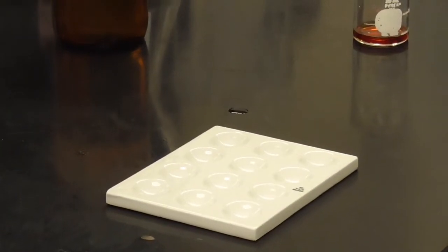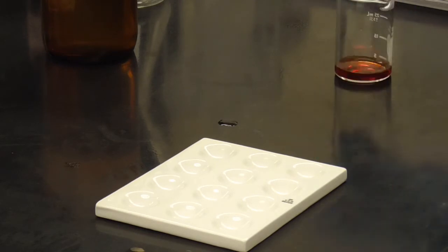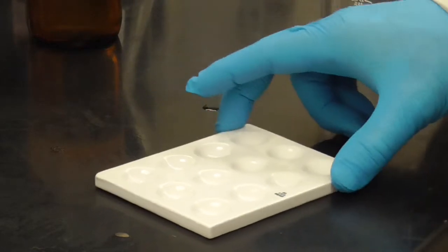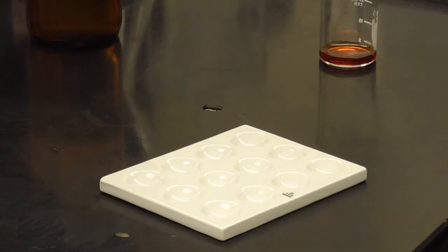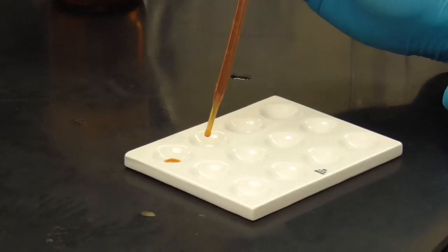All right, step 3, it says, while we're waiting for the temperature to come to equilibrium at 37 degrees, prepare the well plate with starch by placing 1 drop of the iodine. Remember, here's the iodine that we mixed up with the water before. 1 drop of that iodine in each of the wells. And we have 3 rows, 4 tests, and we got 4 test tubes, so this is going to be perfect. Here, here, and here. So this is just the indicator again. We don't need a lot of it. And so just 1 drop in the bottom of each well.